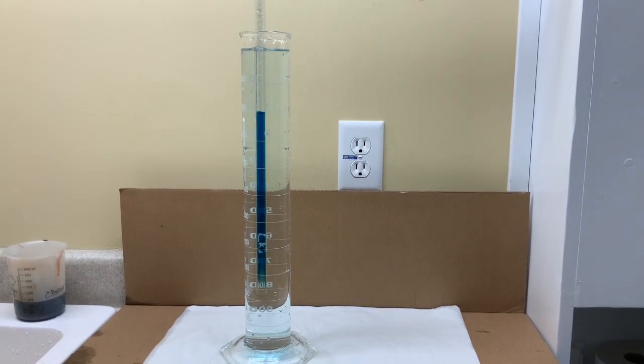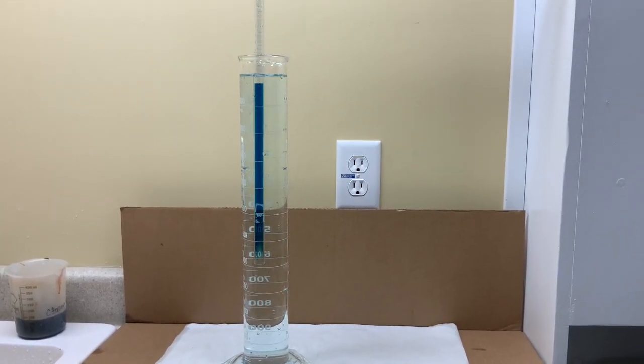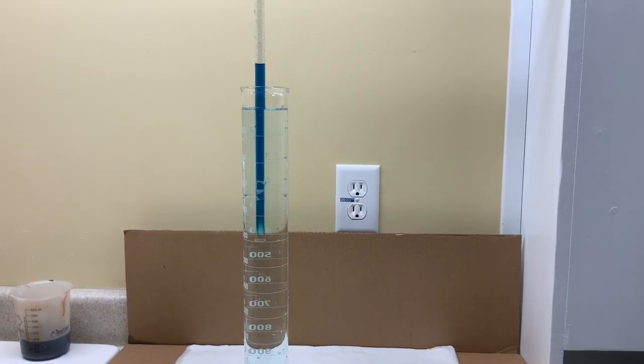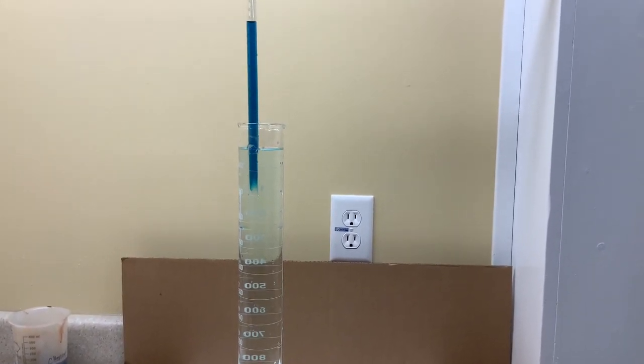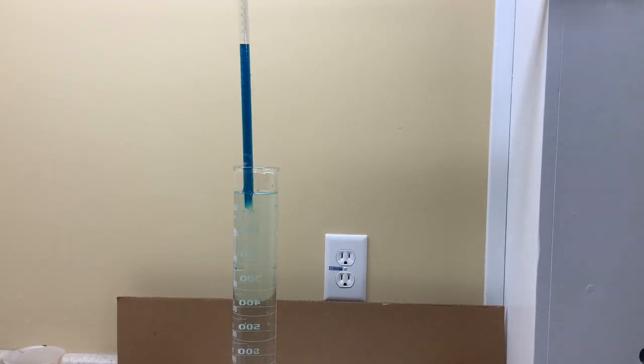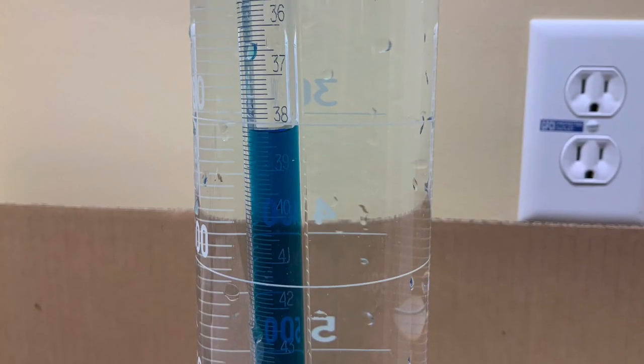Now let's watch a video of the two scenarios that you just answered questions about. There is gas above the blue colored water in the eudometer being lifted up in the very tall graduated cylinder.